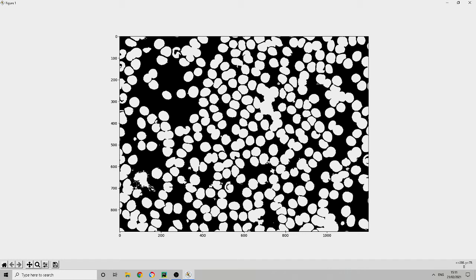So what we need to do then after we dilate the image is we need to erode it, so bring it back to their original size. But because these two sides will be connected, the erosion won't remove that connection, hopefully. So we have made the cells bigger. We've connected all of the perimeters of the cell, but then we erode the image, bringing them back to its original size. But we've connected these parts. So that's what we're going to do. That's an image closing, and it's a very common image processing technique, and we use it to remove noise. That's what we're going to do now.